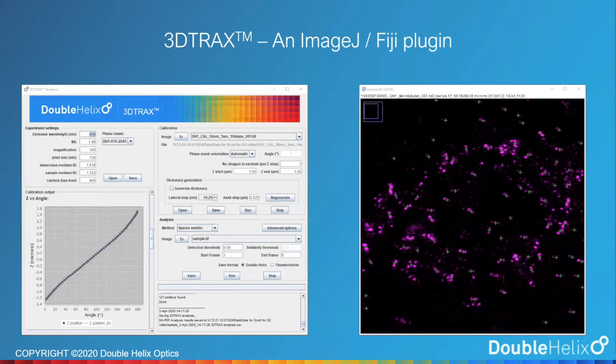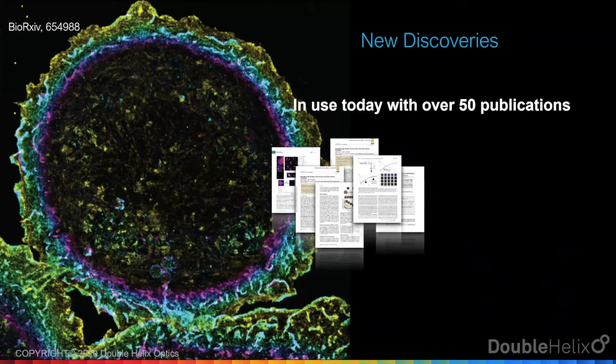Next, Dr. Dominik Wöll will talk about his experience using the Double Helix PSF and the Spindle module for use in studying structures of microgels. With that, take it away, Dominik.